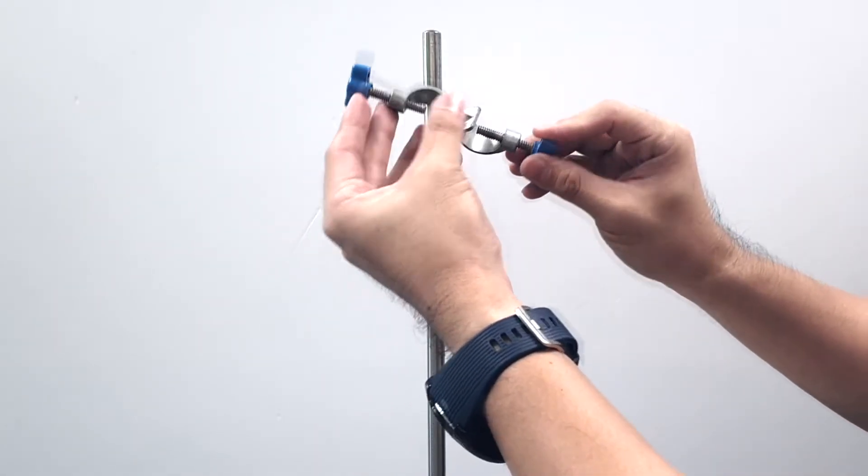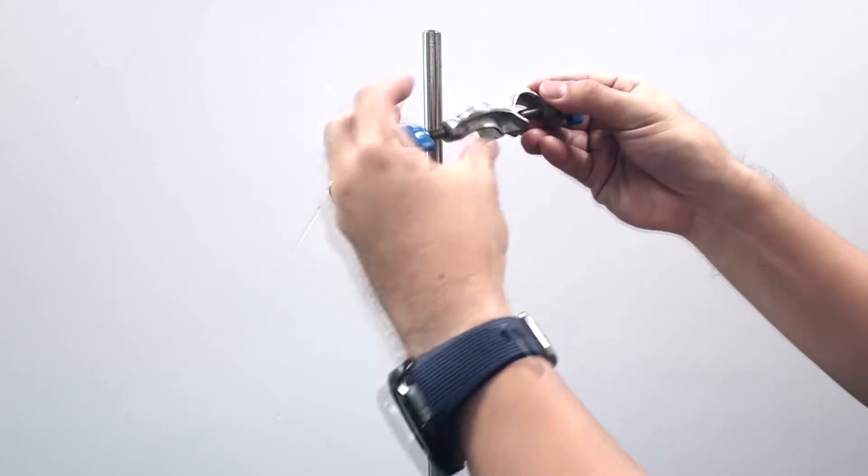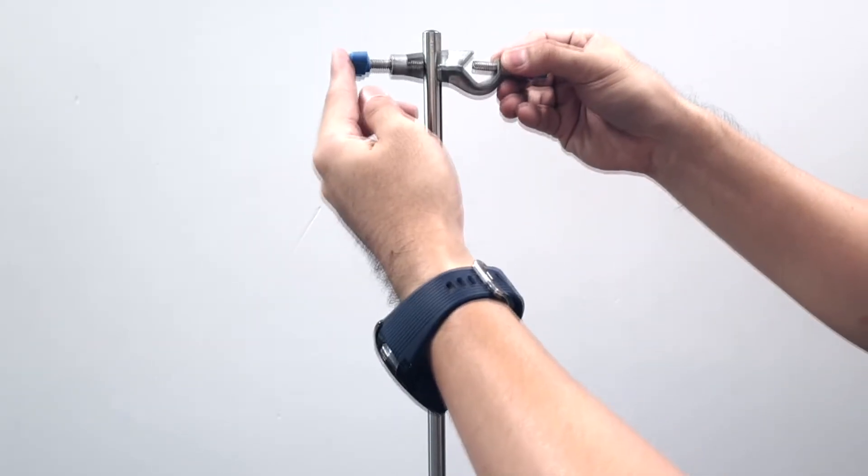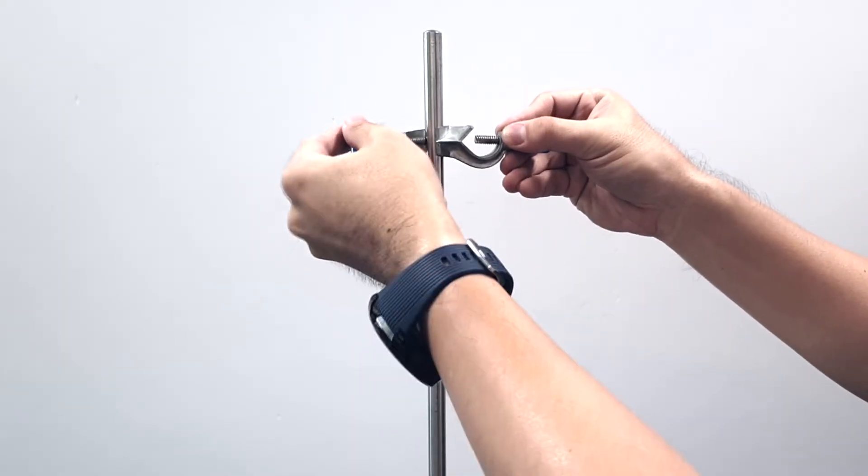The boss has two sides. Both are the same, so it doesn't matter which side you use. Insert the boss as shown and tighten it for the time being.